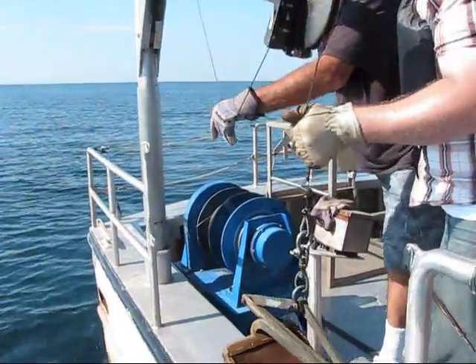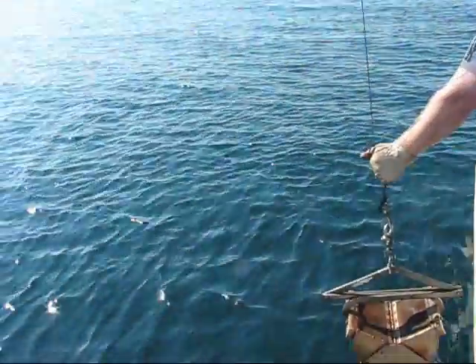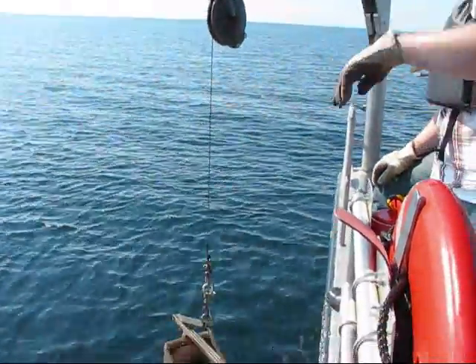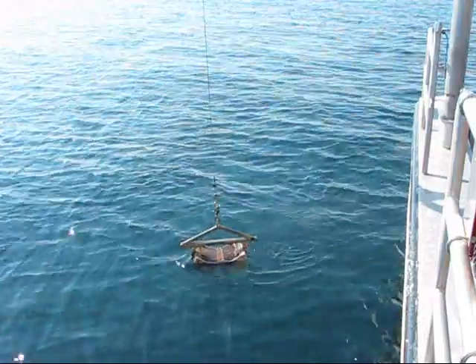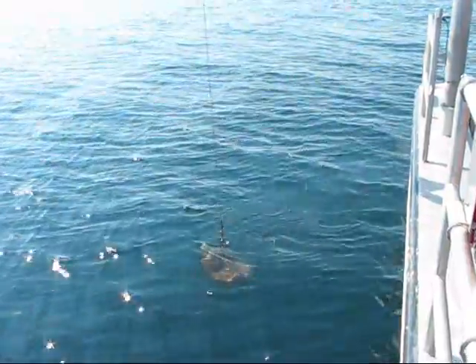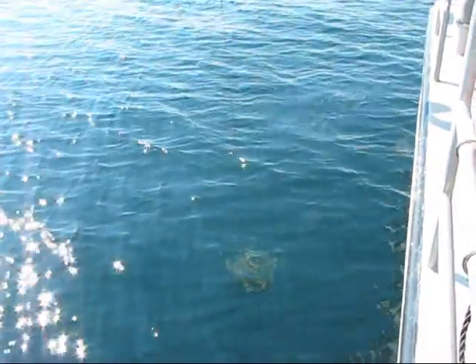Okay, now lift it up, over the side. Okay, we're down. Good. Looks good. We'll see. If it hits the bottom, that trigger snaps, and that draws that grab shut.